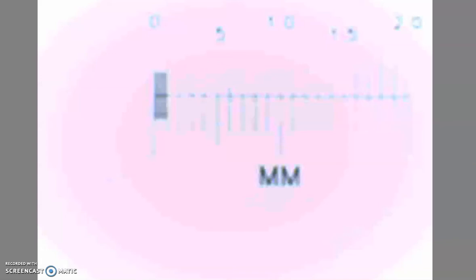So as we continue our exploration of the microscope, one of the most important things that we have to understand when we're using a microscope is how big everything is, or really with the microscope, how small everything is. How little are we talking about? And this gives us a good frame of reference as we are looking at different cells as we look at Lab 3.